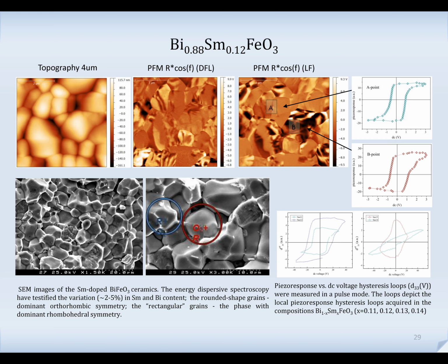I mean, in the bulk and the surface layer, you will see different signals. It's not representative of the material, only of this thin upper surface layer. So we have to be careful with interpretation. And you have enough experience, I know. In any case, the picture is good, the resolution is good, but it's not such a simple system.